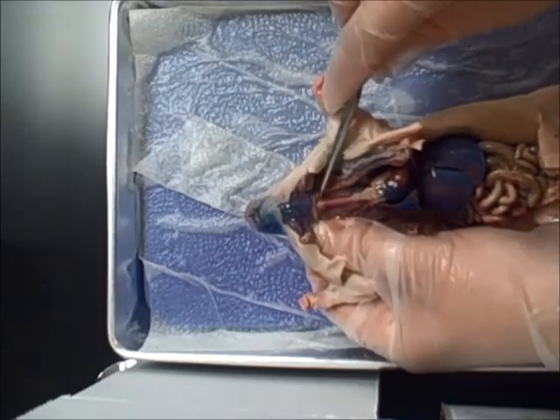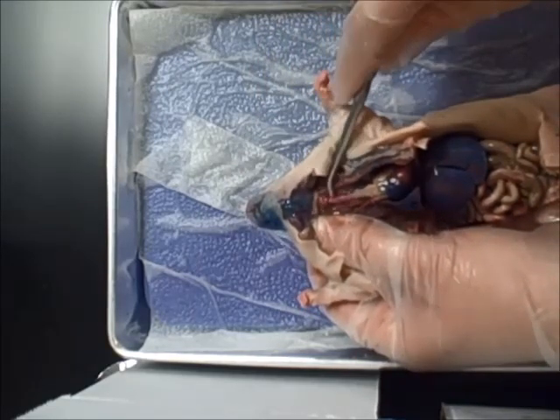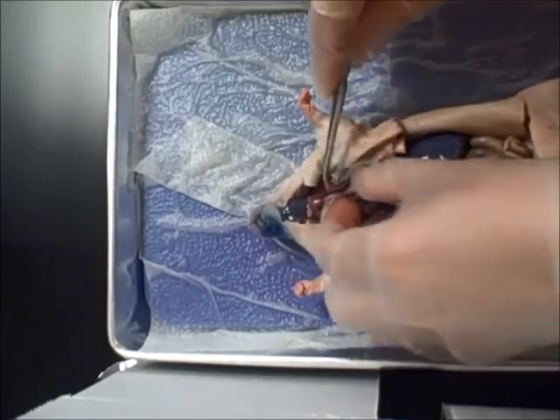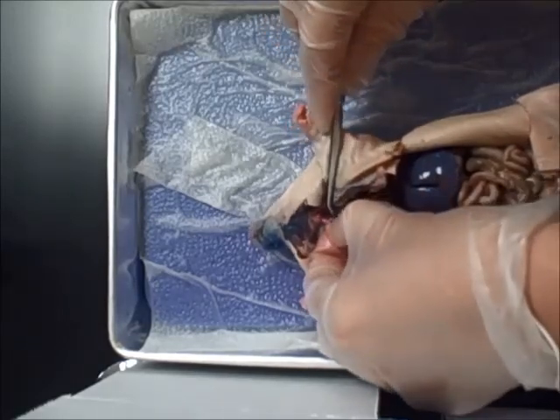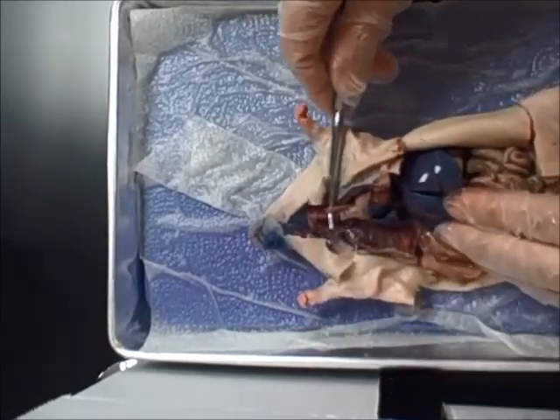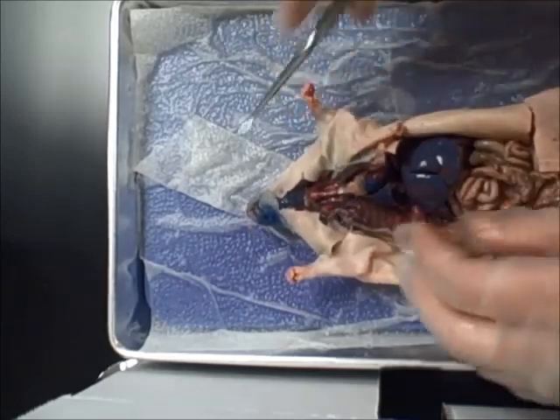Up here at the anterior most end of the trachea is the voice box, the larynx. And then there's the esophagus, which runs right behind the trachea. And the esophagus runs down to the stomach. So here's the esophagus right here, and that runs down to the stomach, part of the digestive system.